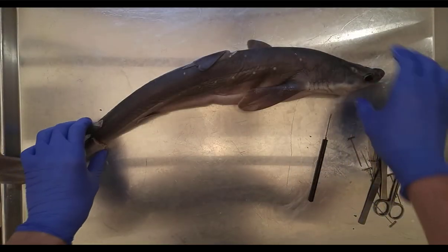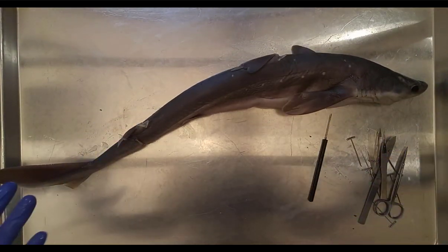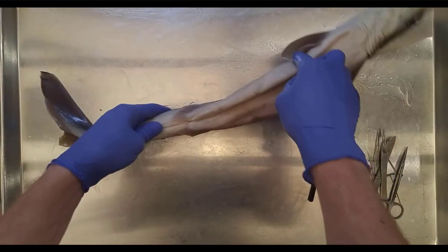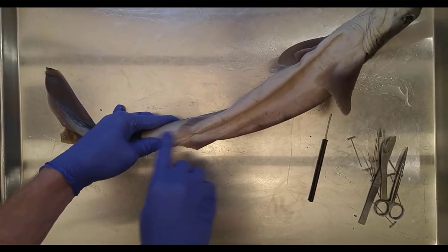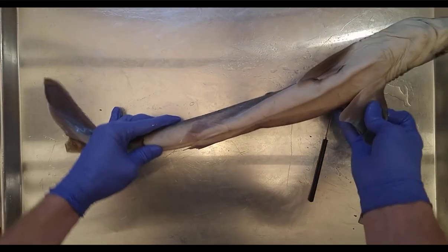Here we have a dogfish shark, a very common species used for these types of dissections. Adults can get up to about three feet long; females are a little bit larger than males typically. This one is a female — males would have distinct claspers on the pelvic fins, which we don't see here.